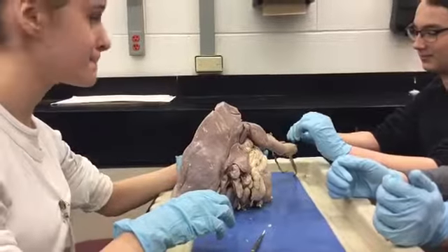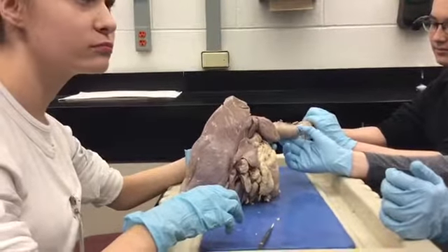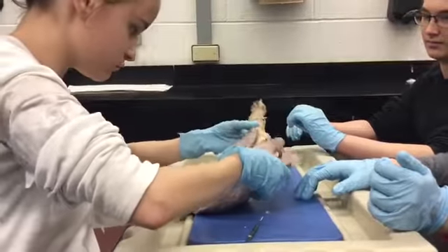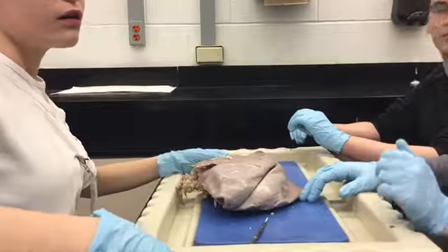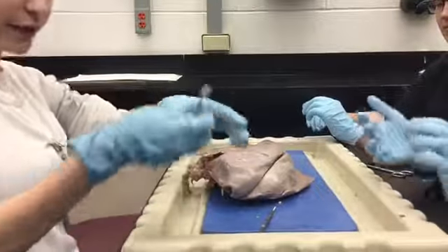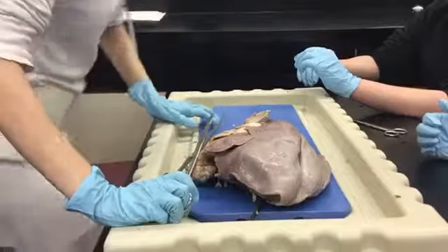Your trachea turns into what two structures? Your bronchi. So take your scissors and cut down the trachea until you get to the bronchi. So we're cutting the trachea all the way down, like from the top? Yep. All right, guys, let's do this together. Two bronchi. All right.